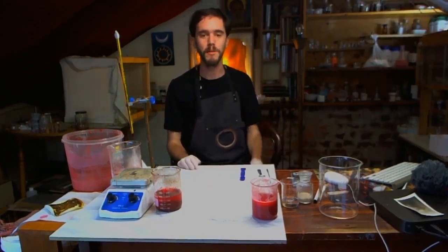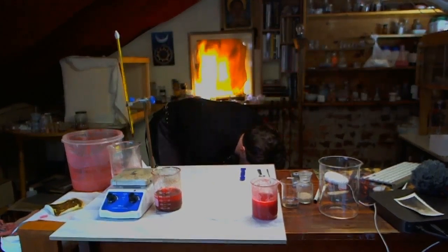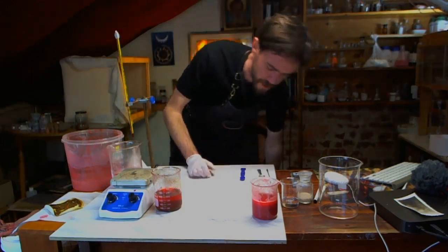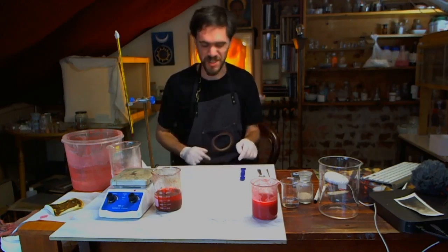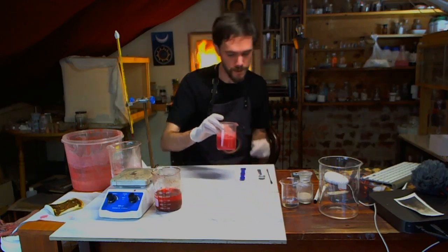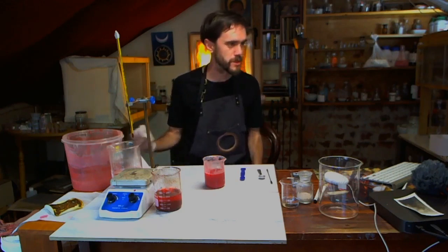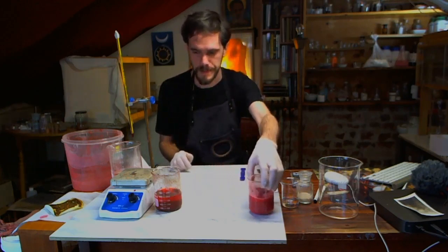It appears that I've thrown out all of my failed copper carbonate experiments, just because they weren't good enough to keep, even for posterity's sake. This looks like we could probably filter this off too now, but the filter funnel's in use, so again, we'll just leave that there.